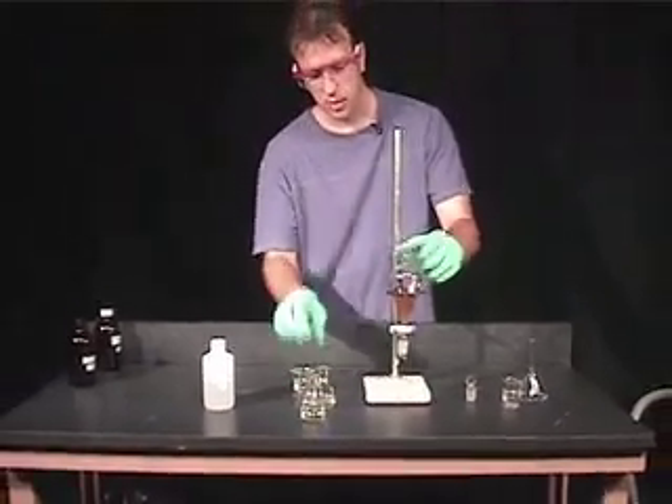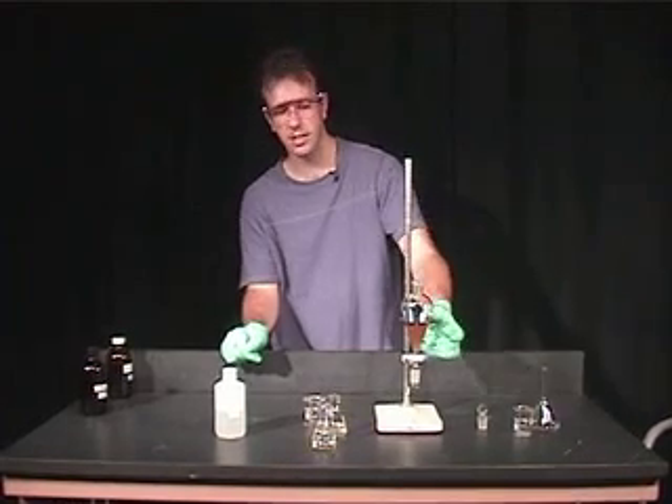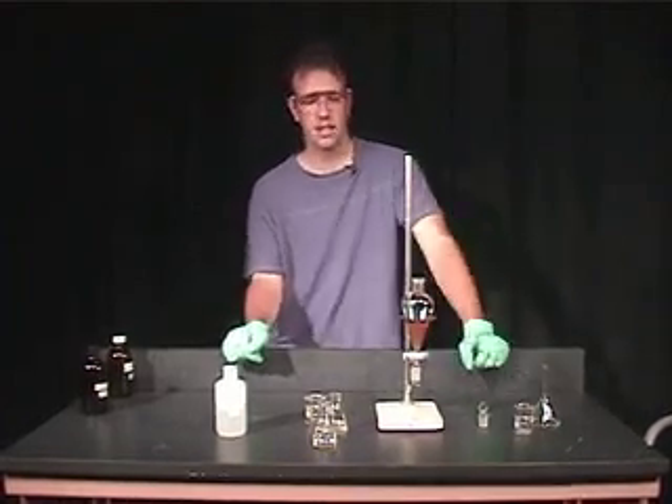We also have to remove the top layer. In this case, our top layer is the aqueous layer from the top of the separatory funnel.